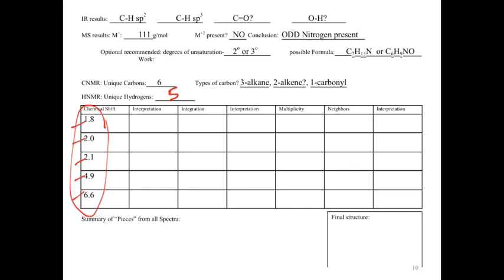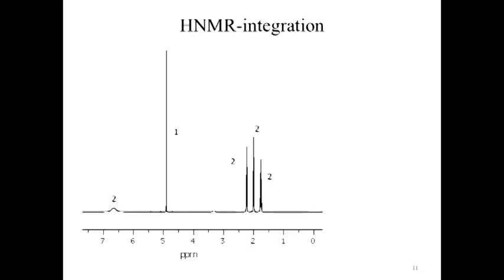Okay, so back to our spectra. You'll notice a little bit more information has popped up here, and that's because of ease of interpretation at this point. Realize that when you look at these, you'll probably see all of this information smashed onto one spectra. So when we go through and look, our integration information is given to us, okay, around each of those signals. If for some reason the integration's not given, say on like the ACS final, it becomes a little bit trickier to deal with, and what you would have to interpret is ultimately the intensity of each of those signals.